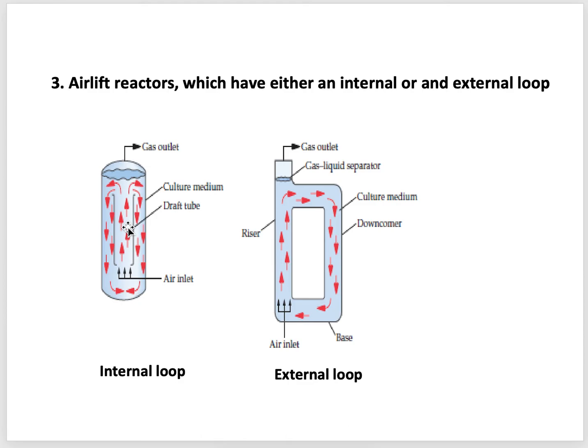Those carbon dioxide gases should be removed. This also happens through the disengagement process at the top. Anyway, let's go back to the gas disengagement of oxygen.